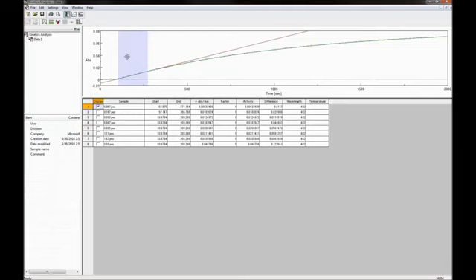Click the blue shaded region and either drag that area around to specify the start and end times, or if the range needs to be shortened, select the edge of either the left or right of the shaded area until an arrow pops up and drag to the desired time frame. As the range is moved, the corresponding velocity will recalculate and is displayed in the table below the graph.